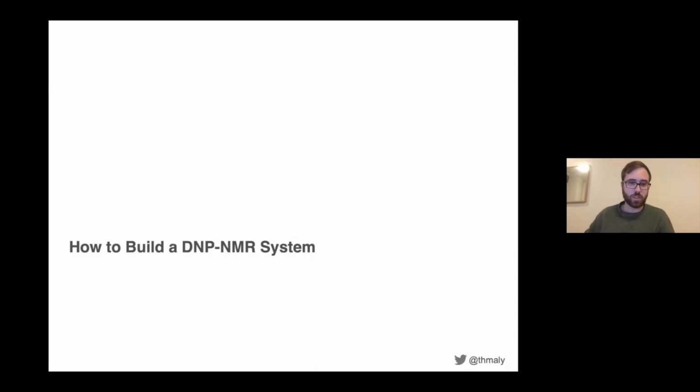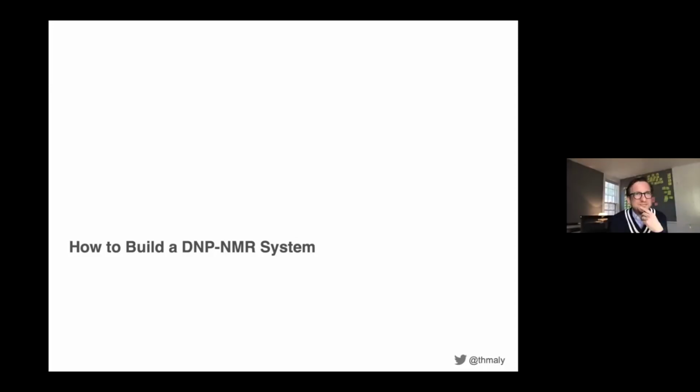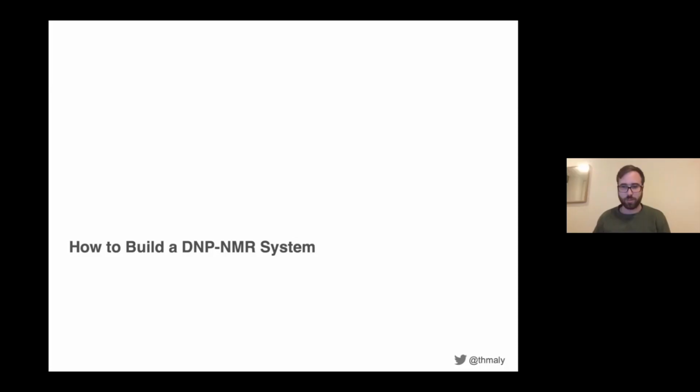This has been a very interesting first half already, Thorsten. Thanks. And not at all my wheelhouse in the slightest, so it's nice to see a little bit behind the curtain of what's going on. So you were mentioning the solid state source improvement. I was curious, with the recent improvements, has that been more centered around the diode design and engineering within the source, or is it more related to the materials being used to make the diodes? And kind of a follow-up to that is, where do you think is the play space for the future of the solid state sources?